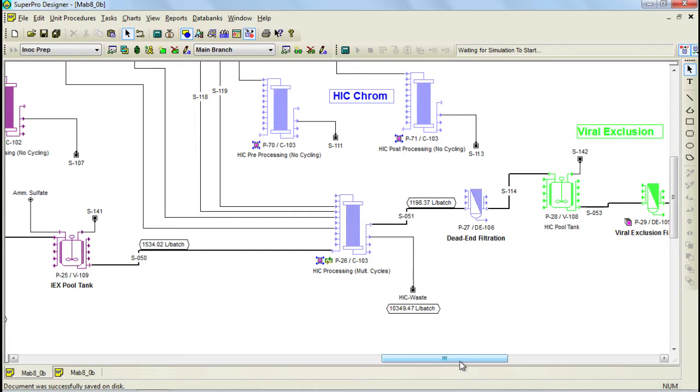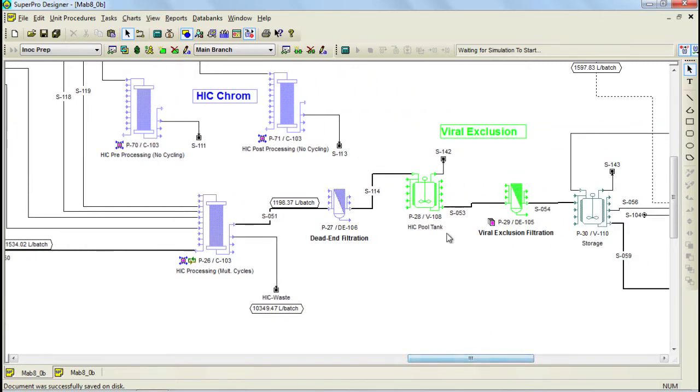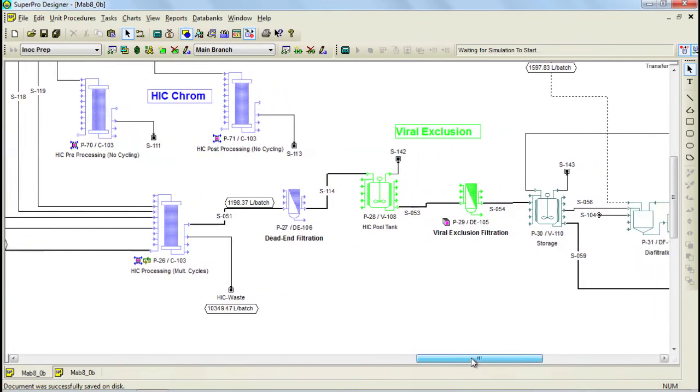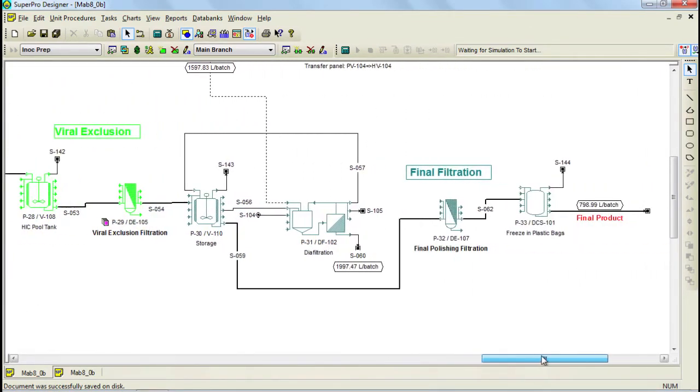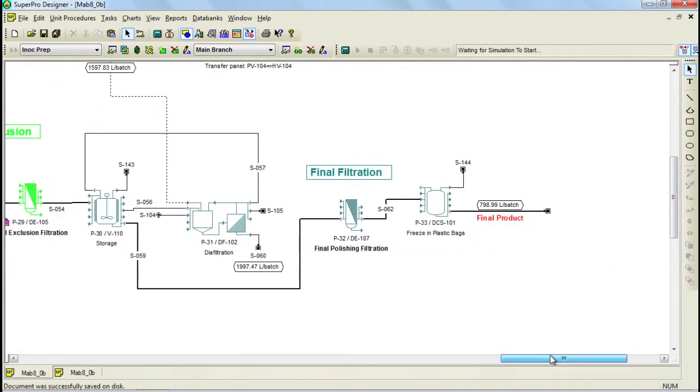The eluate is then collected and a viral exclusion filtration is carried out followed by a diafiltration step where the material is exchanged into the product bulk storage buffer. The remaining final protein solution is then stored in 20 to 50 liter disposable bags.